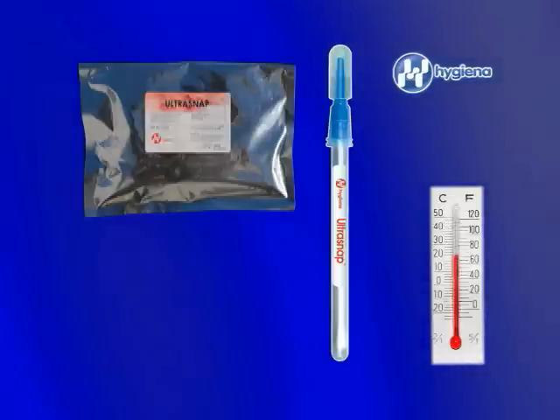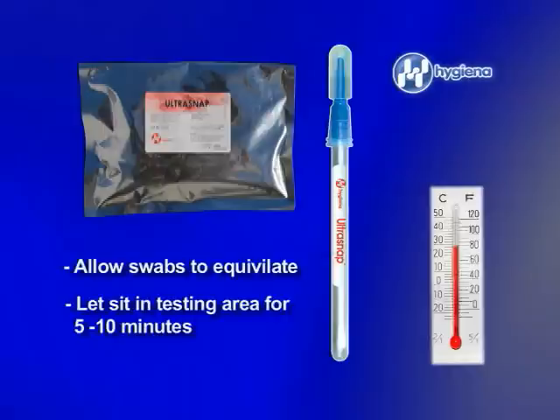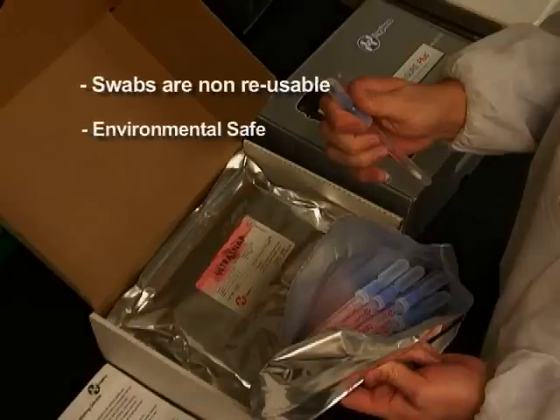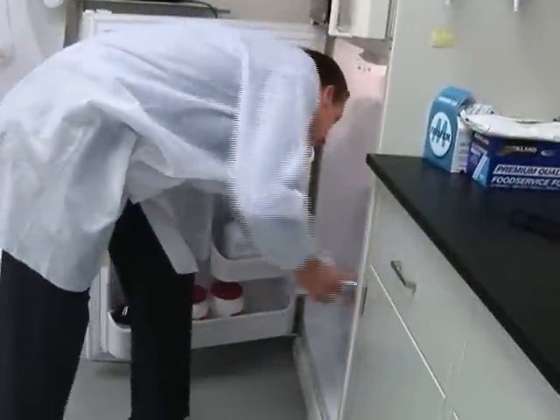Before testing, the swabs need to equivalate to room temperature. Let them sit in the general testing area for 5 to 10 minutes. The swabs are non-reusable and environmentally safe. To save unused swabs, simply close the bag and return it to a refrigerated area.